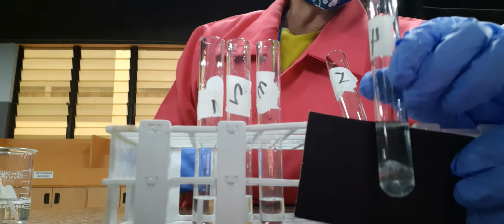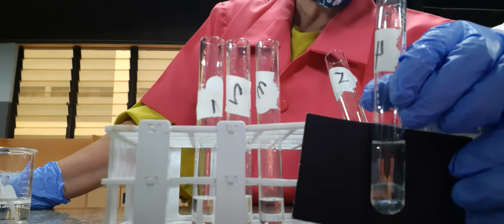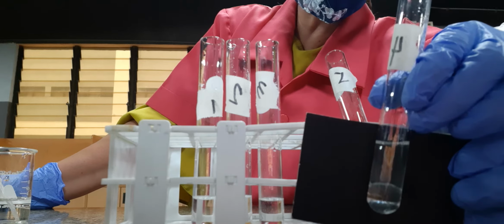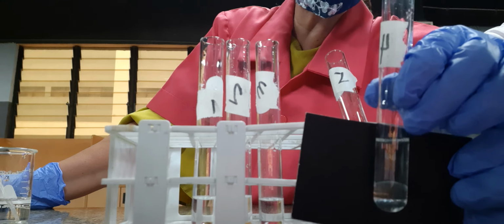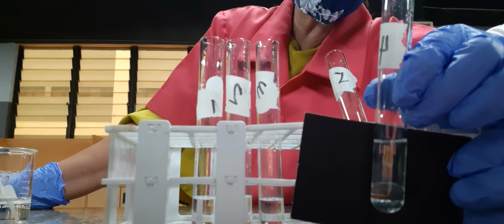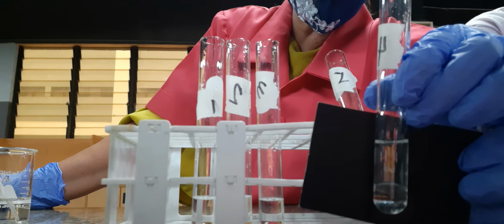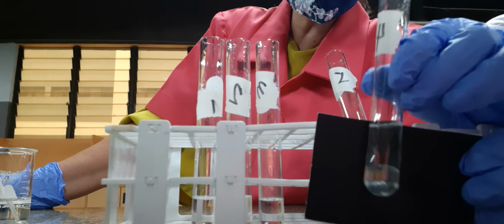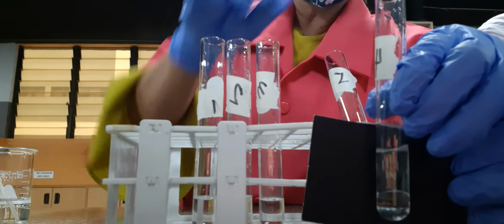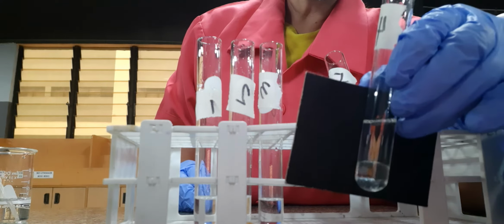Okay. In that case, what do you think is on top? Since water has more volume, that is water on top and the benzaldehyde is at the bottom. So they are immiscible. They are immiscible in water. Let's try to look at that.